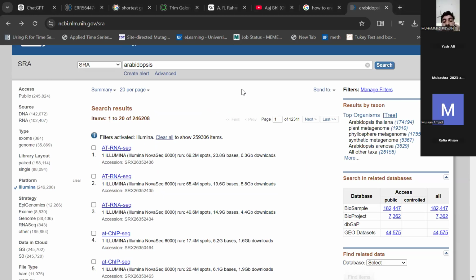Okay, thank you. No problem. So just keep in mind these data sets are already in the NCBI, and they have performed some experiments. Some have exposed Arabidopsis to heat, some to cold, and this data will be really specific.